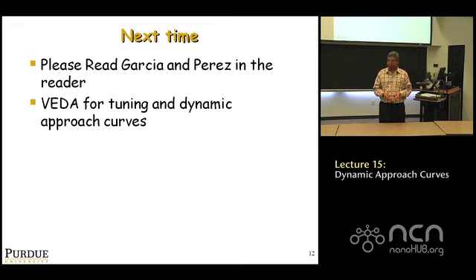However, when you do dynamic AFM, it's not about whether the force is negative or positive. It now becomes whether or not the force gradient is negative or positive. It's a completely different story, okay? I want you to think about it. Because you could have the net force be negative, but the gradient could be positive or negative, right? So in the linearized analysis, we talked about attractive gradients and repulsive gradients, which are not the same as attractive forces and repulsive forces. Okay, I hope you understand that.